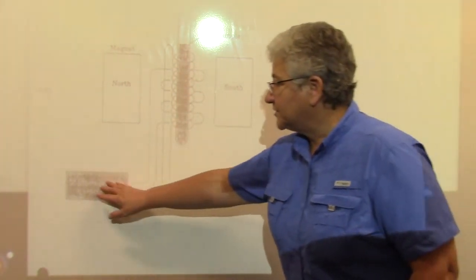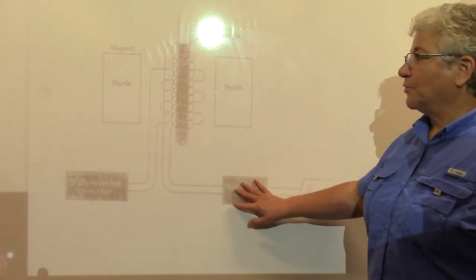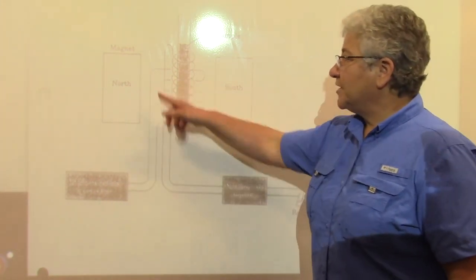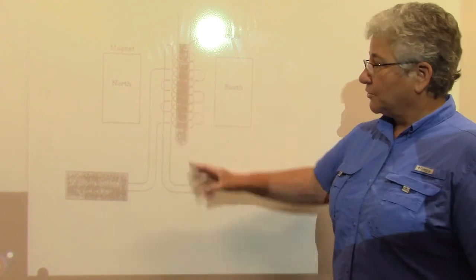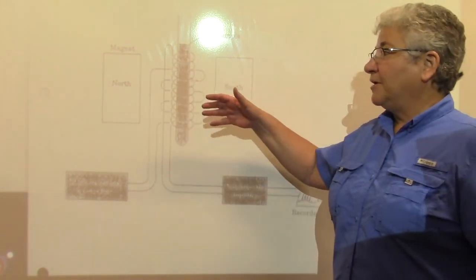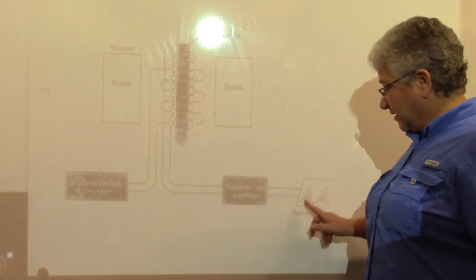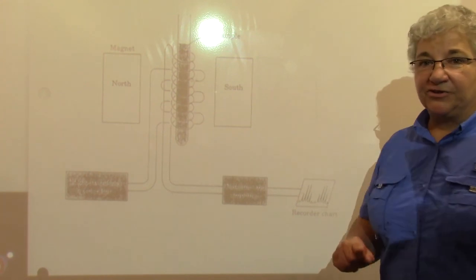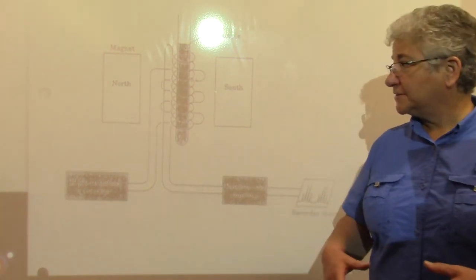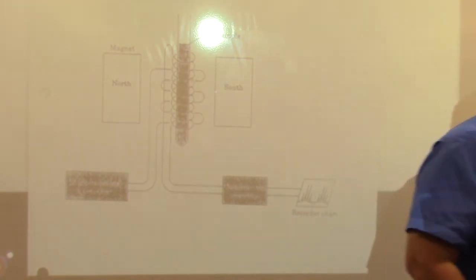And then over here it says radio frequency generator, and over here it's the detector or recorder. Essentially what you're doing is using these radio frequencies, which come through all the wires here, and firing that at your molecule. Whatever is absorbed by your molecule gets recorded by the detector, and you actually get a picture of your spectrum. Okay. So the magnet is crucial for NMR spectroscopy.